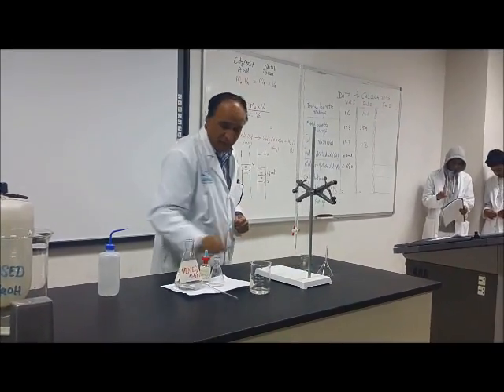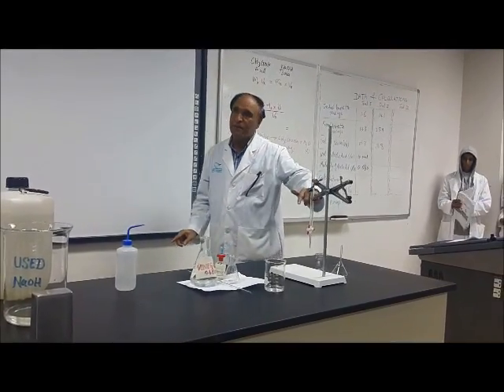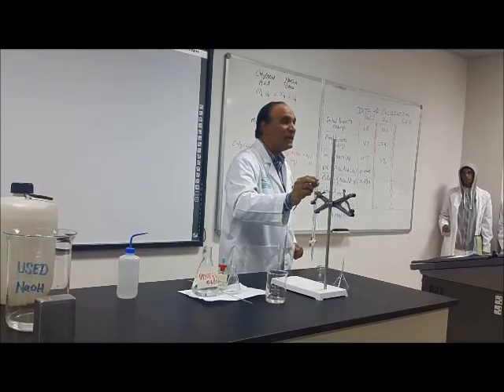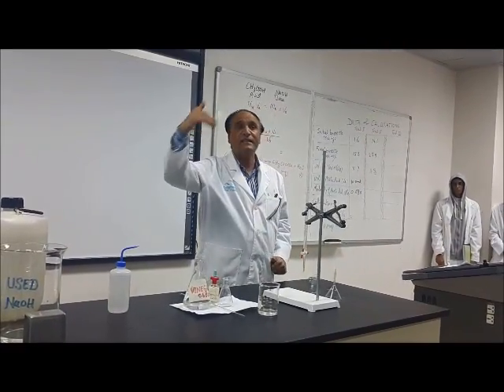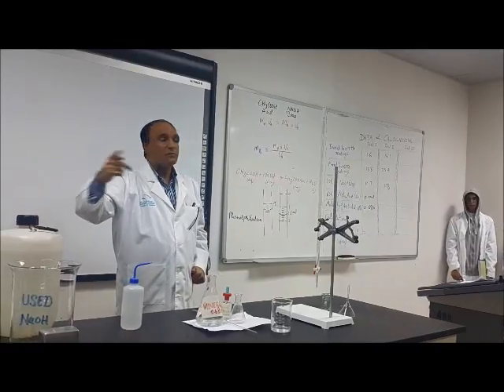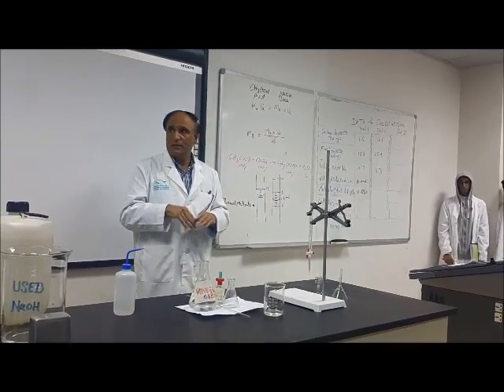Now, listen. This you will wash with the tap water. But look at the burette. It is empty, but there are drops of sodium hydroxide. Sodium hydroxide is a base. It will react with the air. What is acid in the air? Oxygen? No, oxygen is neutral. Which gas is acidic?